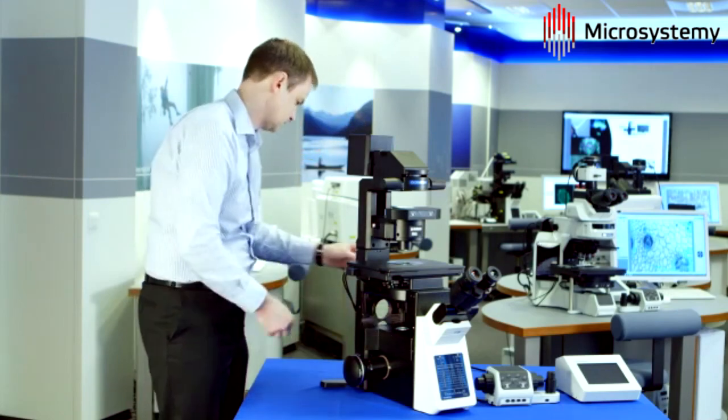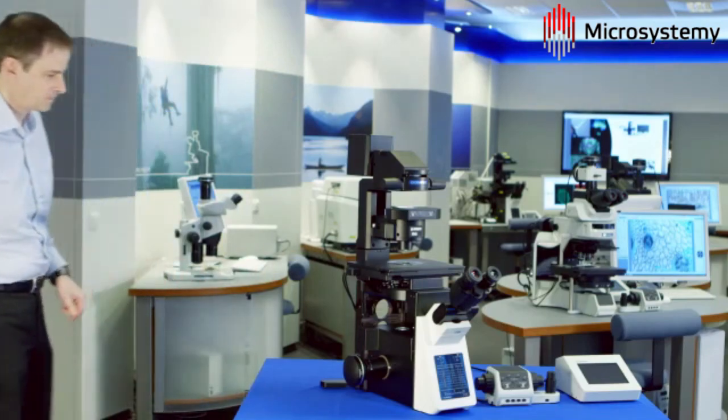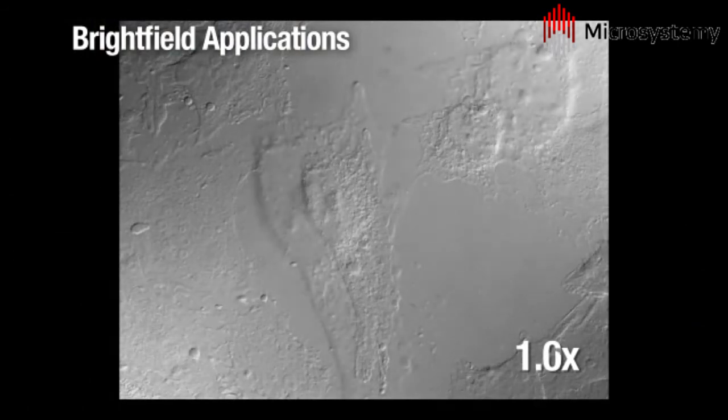Used alone, this is ideal for selecting the optimal view in bright field imaging, such as during in vitro fertilization procedures, or with these HeLa cells observed during DIC.